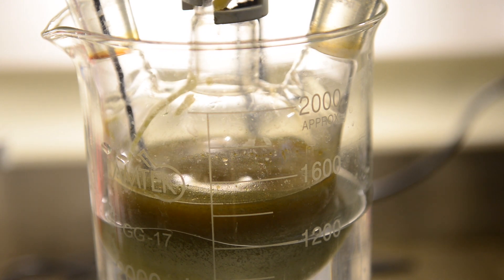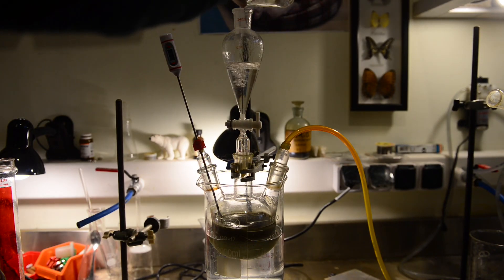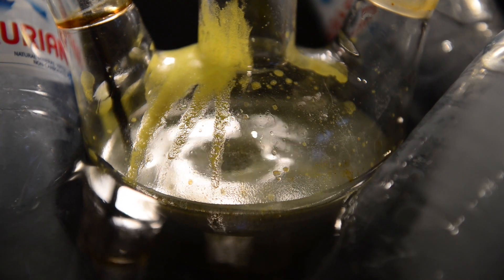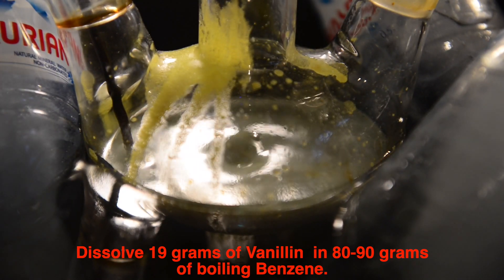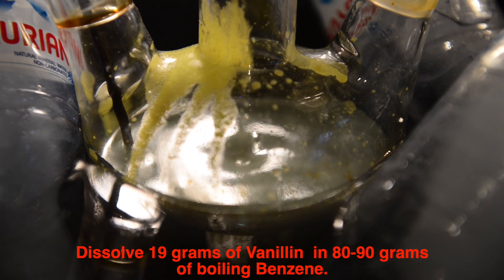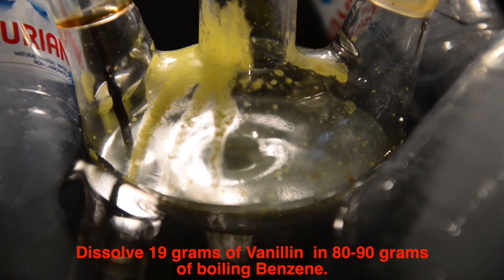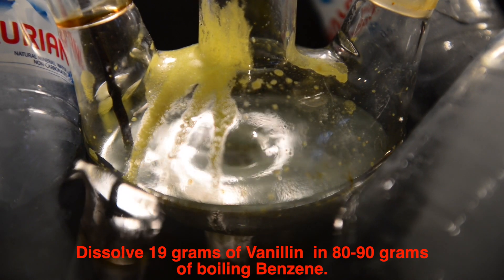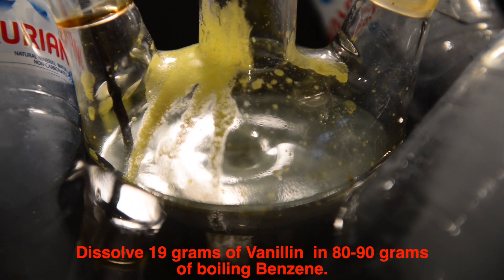Now I am ready to add vanillin. According to patent 19 grams of vanillin must be dissolved in 75 grams of nitrobenzene. As far as I am using benzene instead of nitrobenzene the solubility of vanillin decreases and requires more benzene to be fully dissolved. Instead of using additional solvent I have decided to heat benzene to boiling temperature. Near the boiling point temperature solubility of vanillin increases and little more benzene is required to fully dissolve vanillin.